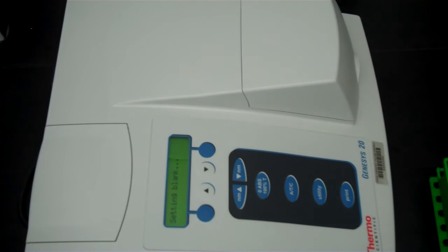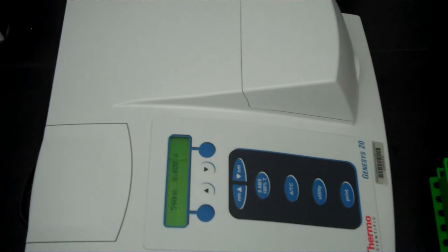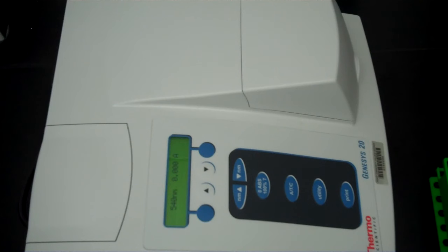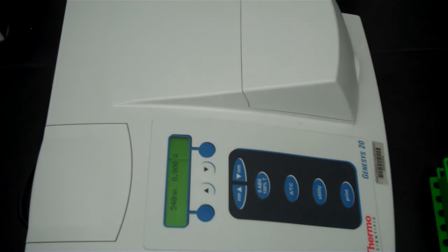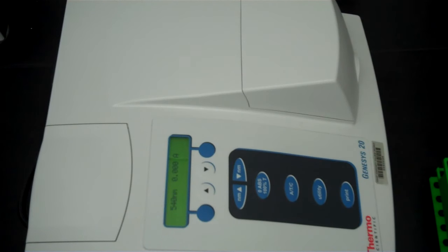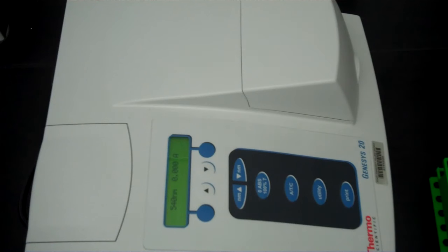When you do you'll see the message setting blank and when it's done it'll read the wavelength that you've set it at, in this case 540 nanometers and 0.000A and that A simply stands for absorbance. In this class you will only be doing absorbance readings not percent transmittance readings.